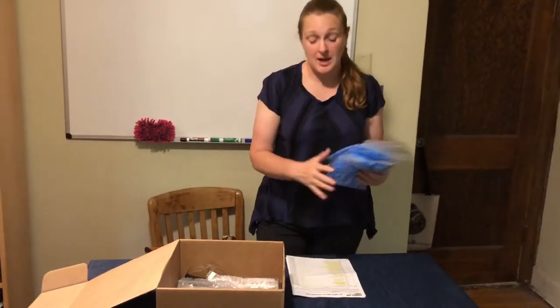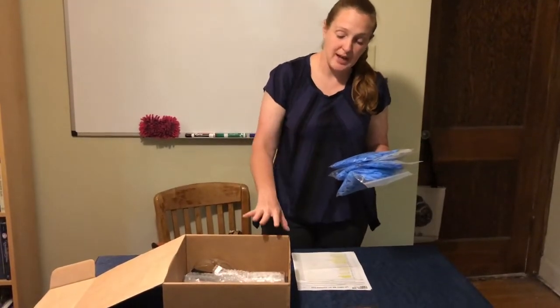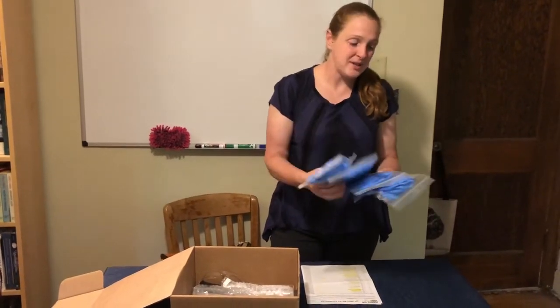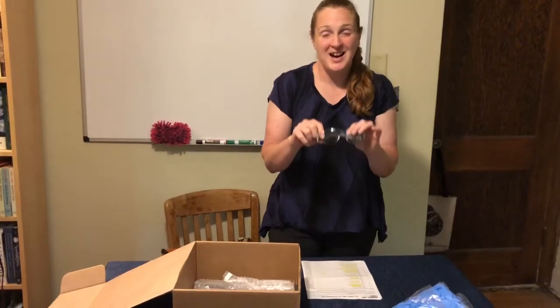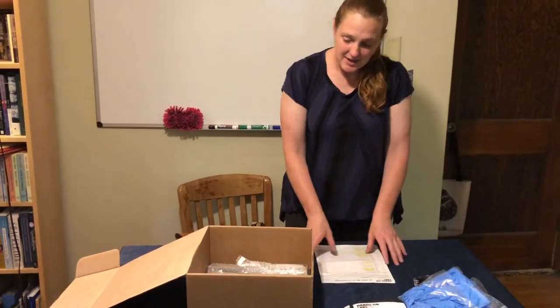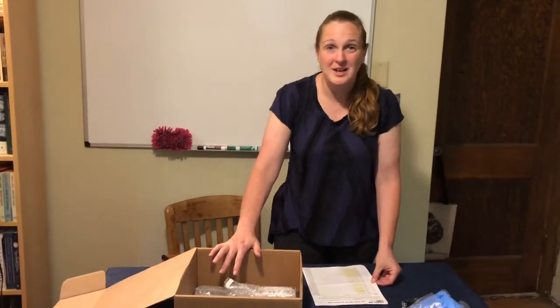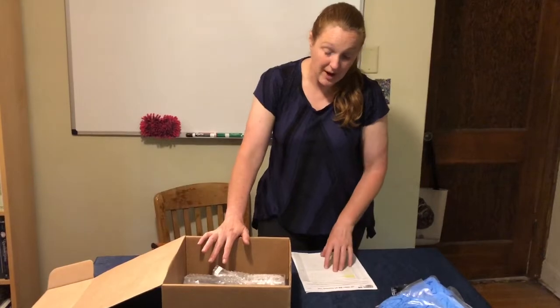The next thing you're going to do is unpack and double-check all of the supplies against the content list. One of the things I'm really enjoying about the hands-on lab kit is that they're trying to keep things together. It may seem initially kind of weird that there are four different bags of gloves, but this will help us for every time we need to go into a lab where gloves are required. Next you're going to want to find your safety glasses — any time you are doing your lab, make sure you are wearing your safety glasses. Lay out your content list and gradually go through everything in the box, putting a name with each item and marking it off.